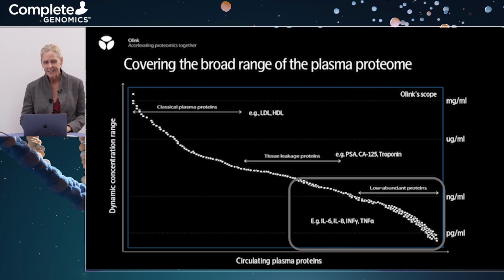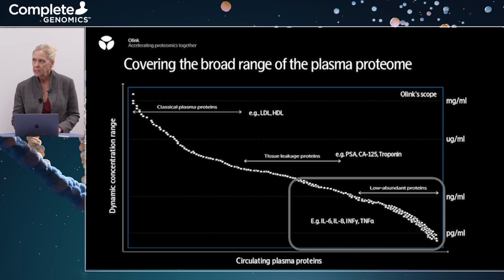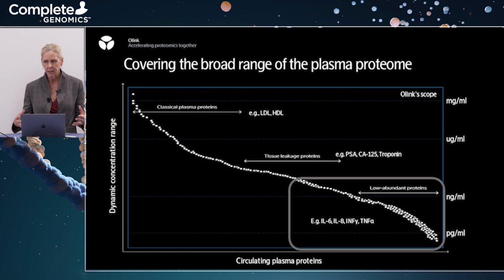You never know. And so a little bit more about proteomics and how people are using this capability, particularly in the context of a world where the gold standard really has been mass spectrometry. Where we provide a lot of value is in this range, in this lower right quadrant.